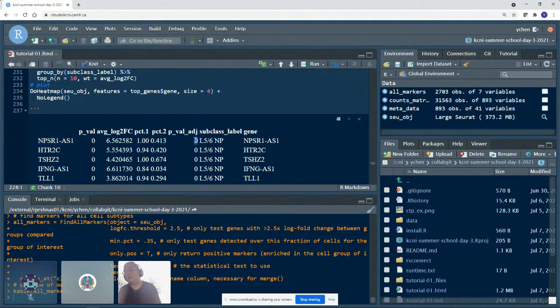P-val adjustment is just multiple comparisons correction. For people who have less of a background in math and stats, when you have a statistical test and you test it on thousands or hundreds of genes, by the nature of the p-value, some of your results will be false positives. So we do an adjustment to make all the p-values a bit bigger, and then we do our cutoff for what is significant. Ultimately, the point is to try to control and not have false positives.